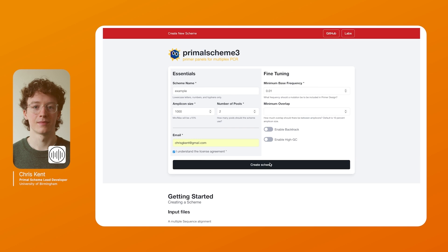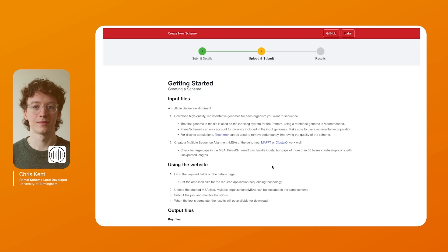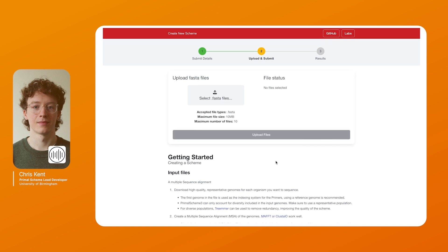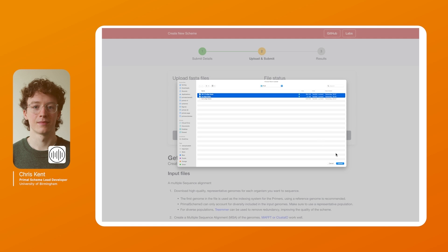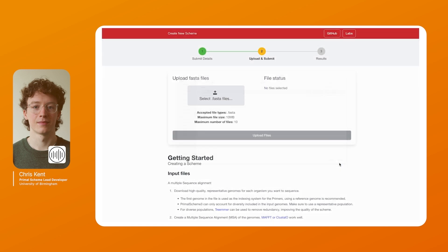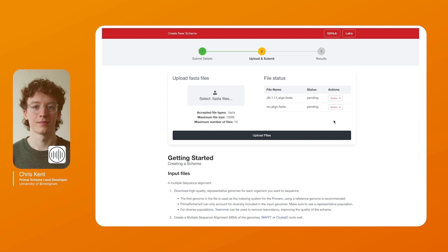When you hit the create scheme button you'll be redirected to an upload page. So next you upload the files which you've pre-made. Here we have the RSV and the COVID file. You can see once they're staged to upload you can add or remove files as you want. When you hit upload files they're uploaded and the job is started.